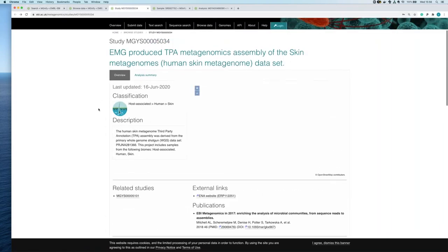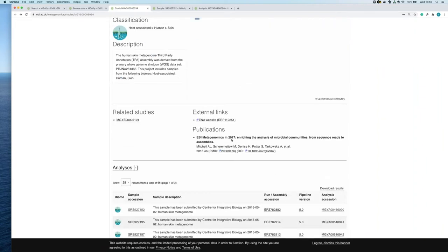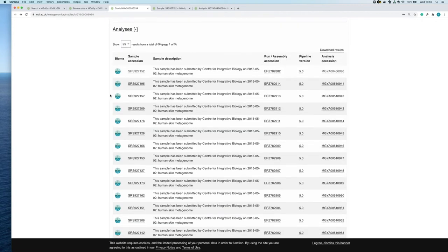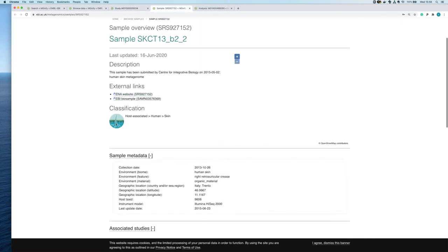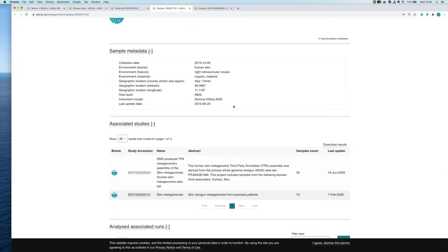If you click on the sample you can see the metadata — external links to ENA and a snippet of the metadata we take from ENA. The quality of this metadata will depend on what you supply at submission.